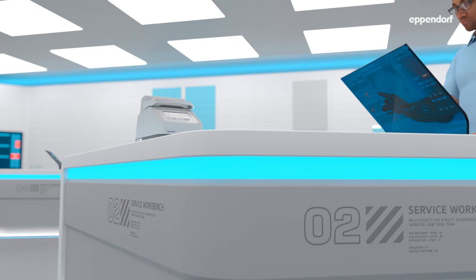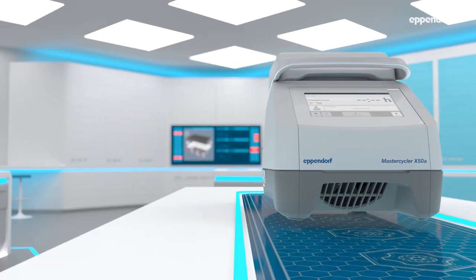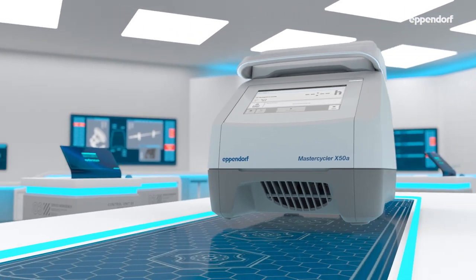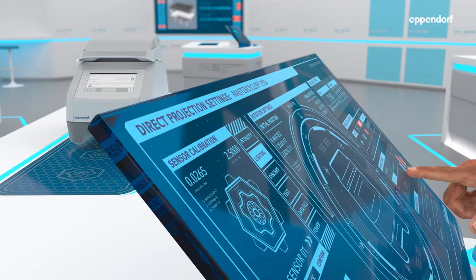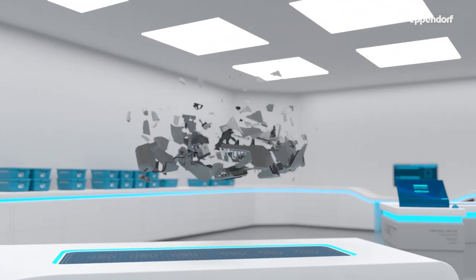Today, we will watch Tom perform a maintenance service on your Mastercycler. Hey there. Yeah, please come closer and have a look. I will perform the necessary maintenance steps to make sure your cycler is in good working condition for ensuring reproducible results.